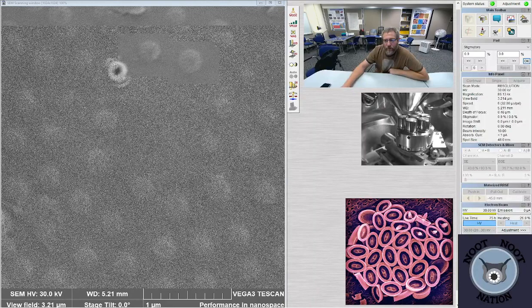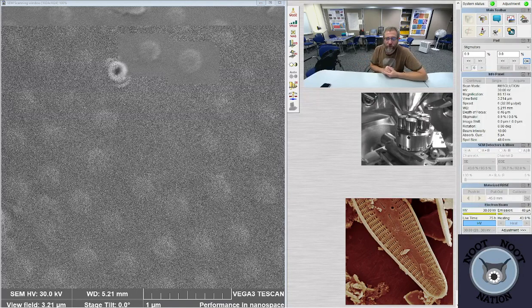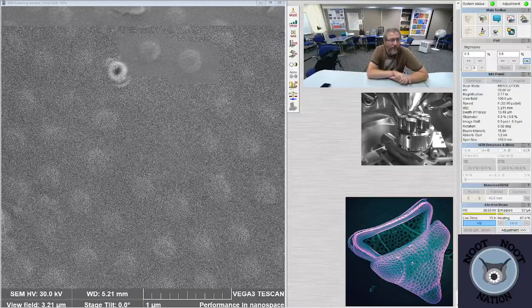Is it all manual focus or automatic? The SEM has an option for autofocus, but the problem is it doesn't know what you want to focus on. There's a lot of three-dimensional structure. It will get it kind of close if you do the autofocus, but really only in bulk. If everything's out of focus, it'll get it to the point where you can see things. And then after that, it's picking the thing you want to focus on and then doing it manually.